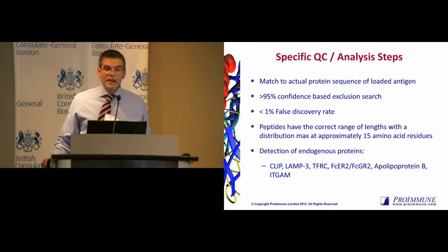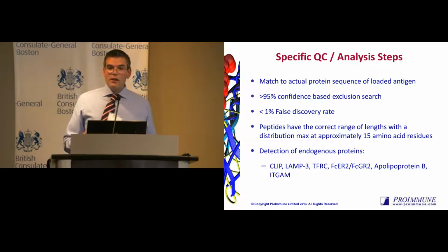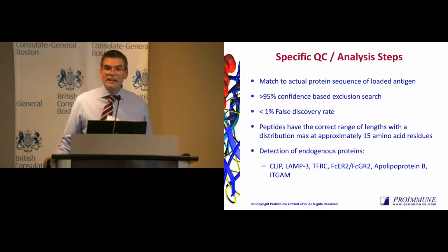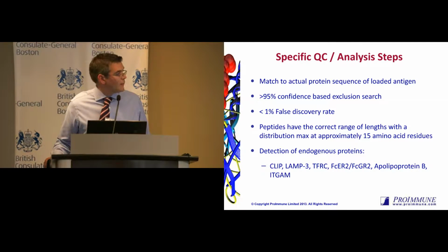We also generate essentially a scrambled decoy library, which allows us to determine the false discovery rate. So the decoy library is the full human proteome plus your protein sequence that has been scrambled, so it's like reverse order. And then we repeat the search with exactly the same criteria. Of course, you wouldn't expect any of those peptides to come up unless it's completely by chance. So it's this chance of less than 1%, which is, again, publication standard for the false discovery rate.